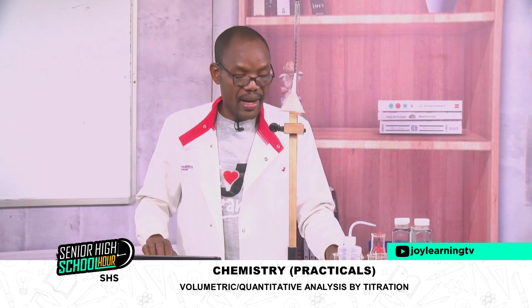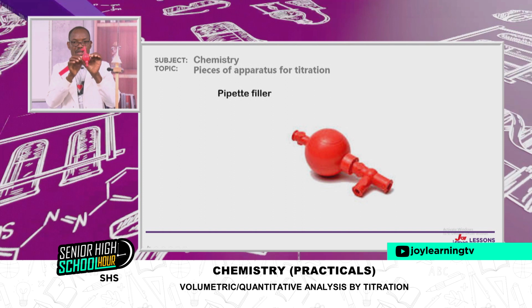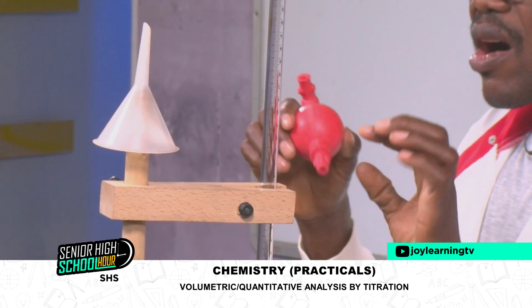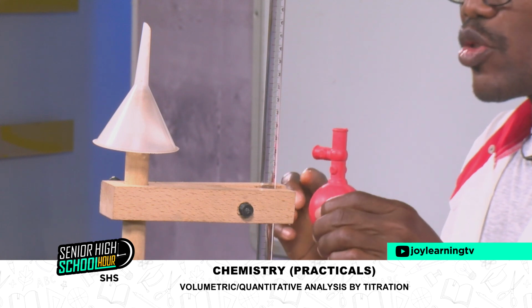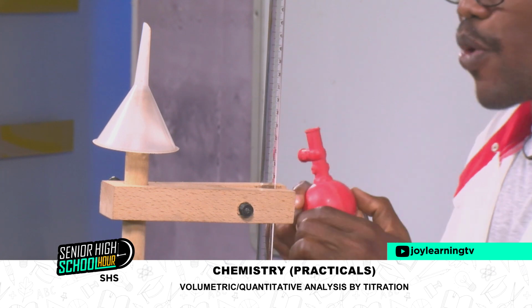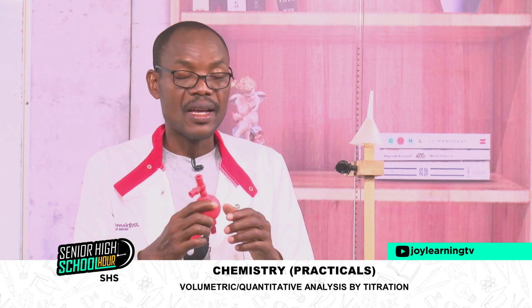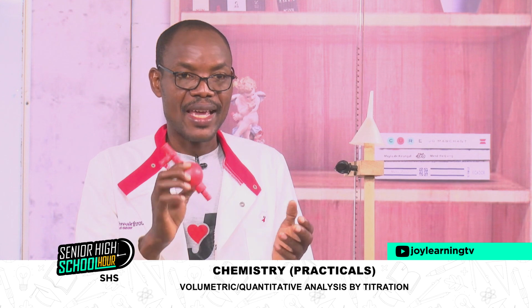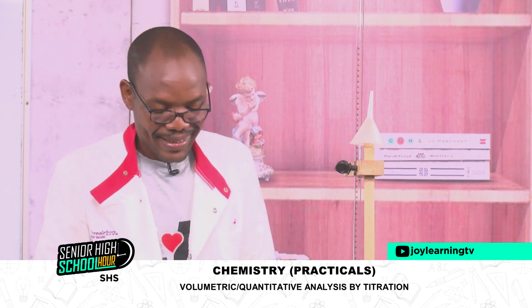The next one is the pipette filler on our screen, as you can see. Because the student population in our various schools is so large, you may not have enough of these for all students. So most of the time, when we want to pipette a solution, you have to use your mouth. But here, we are going to use the pipette filler.